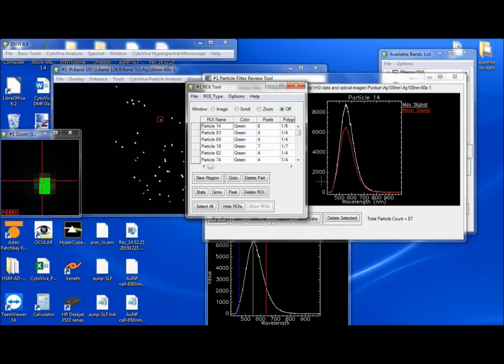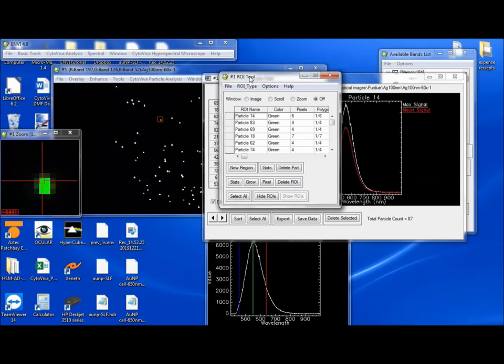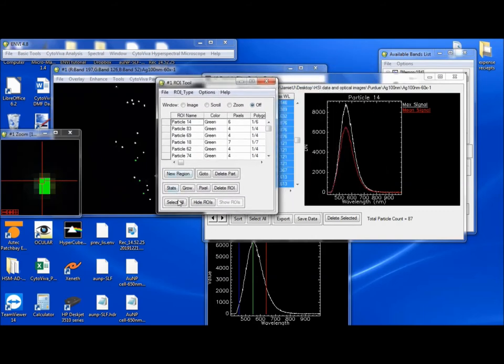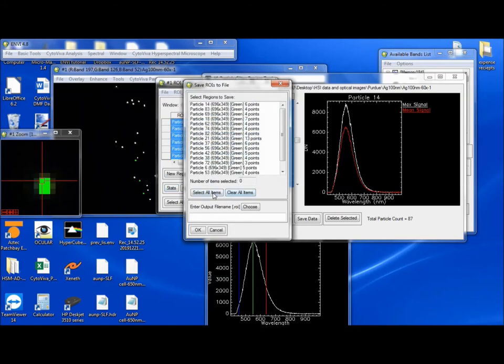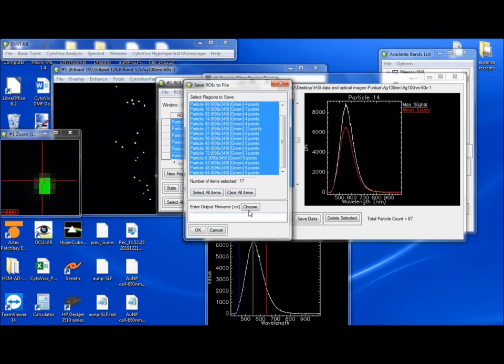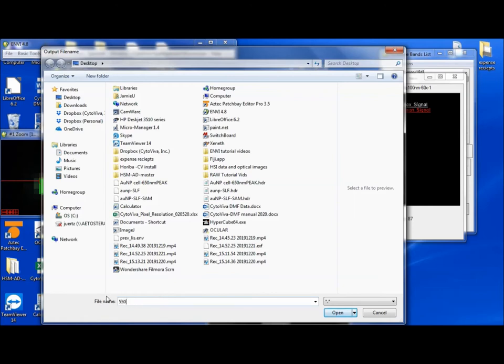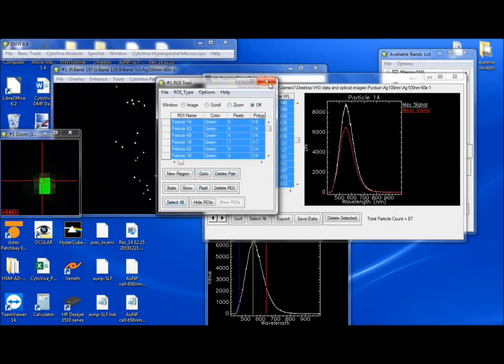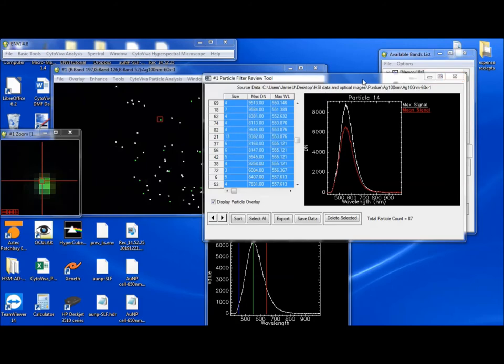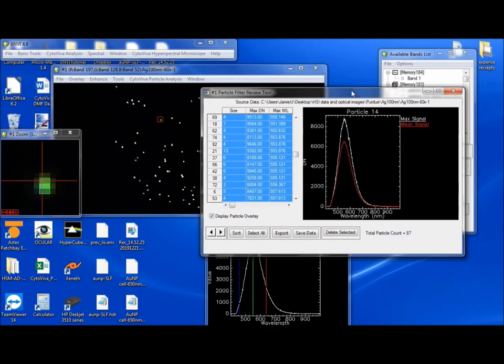Also, you can export this as a region of interest. So if you wanted to, you can have this region of interest. And of course, with the region of interest, you can select all and do the statistics, like we've seen in the other tutorial. Or you can just save it. So here, if we wanted to save this, save it on the desktop as a 550, 560 nanometer ROI. So that ROI is now saved and I'll show you how to overlay that.